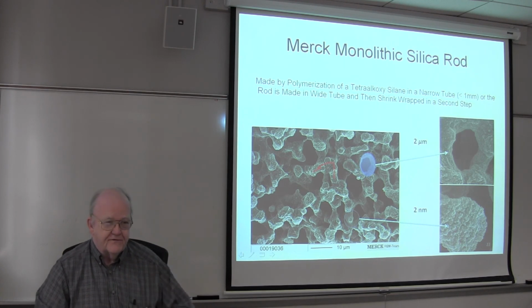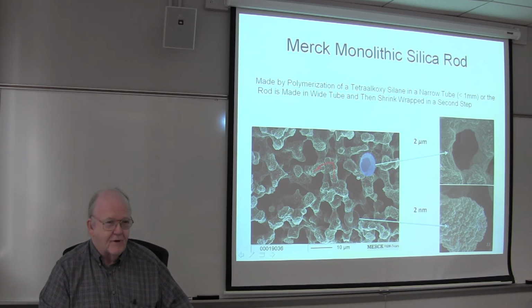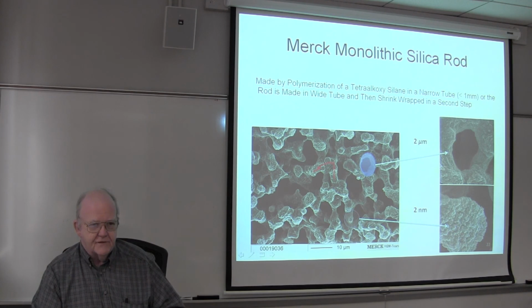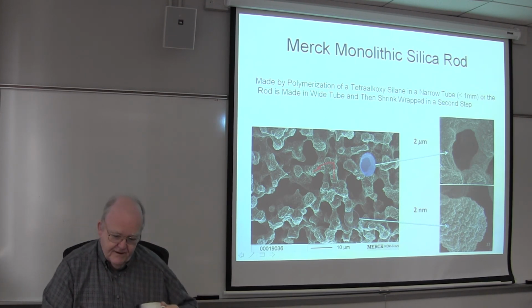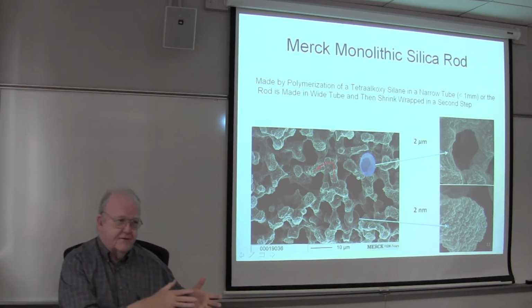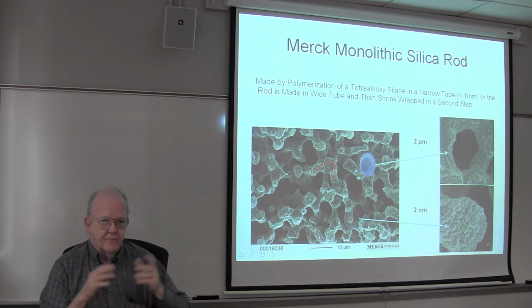So if you go this route, you better love C18 or C8 coatings on your silica and not much else. But there are definitely good things about these. The patent will wear out eventually and other people will enter the business. And you do have to make a decision: am I going to use a monolith or am I going to use a conventional packed bed at some point when you buy a column?